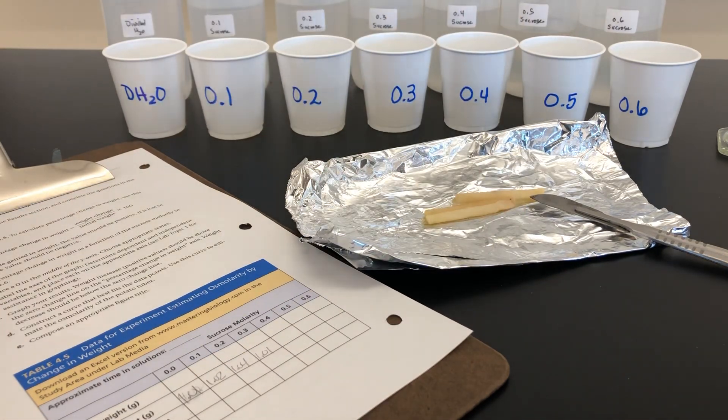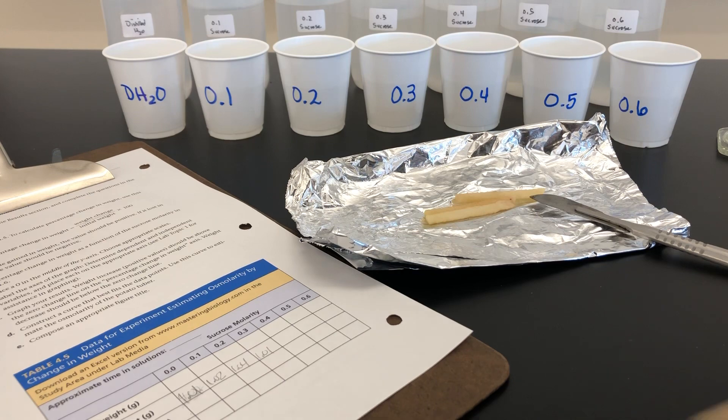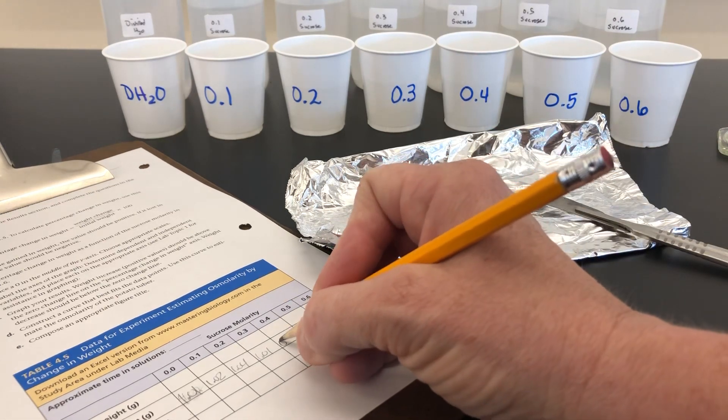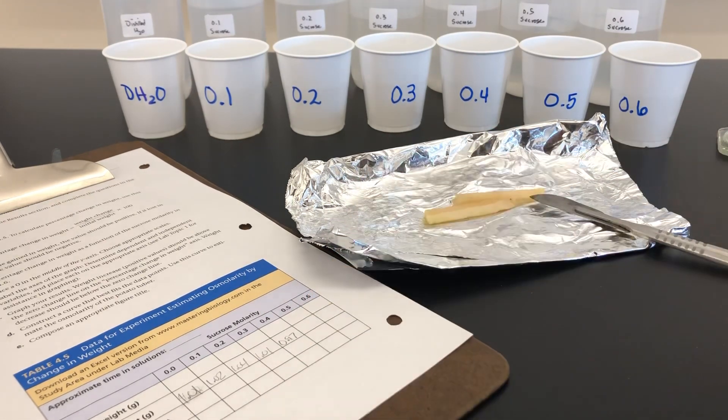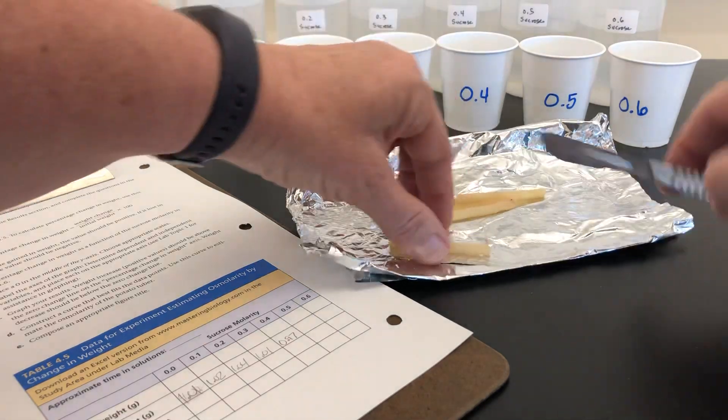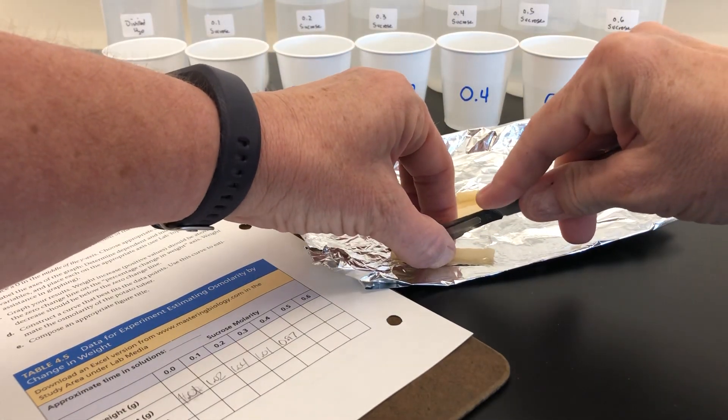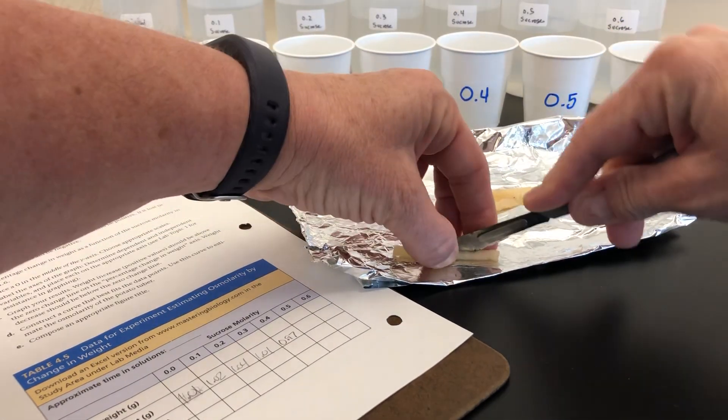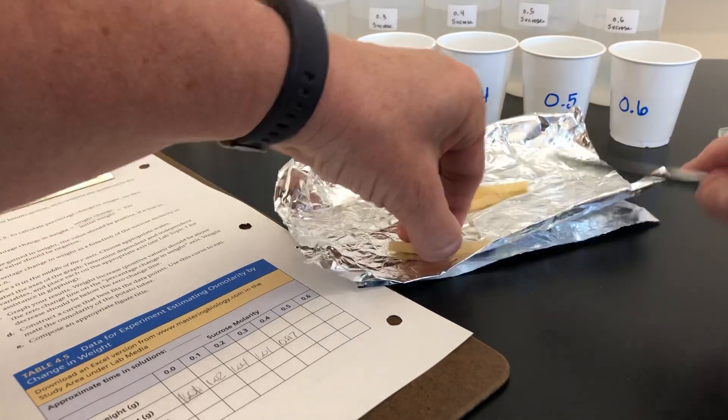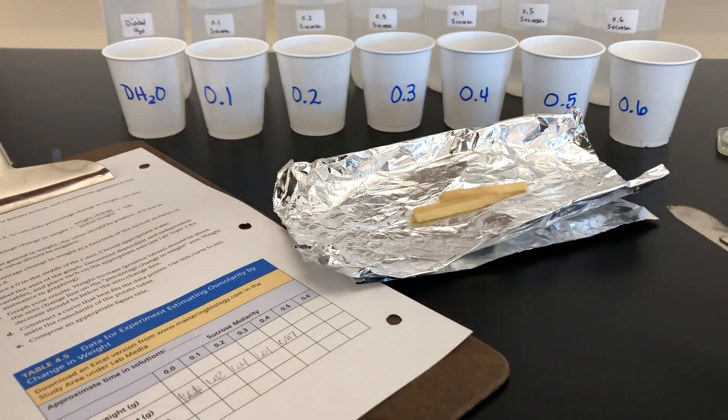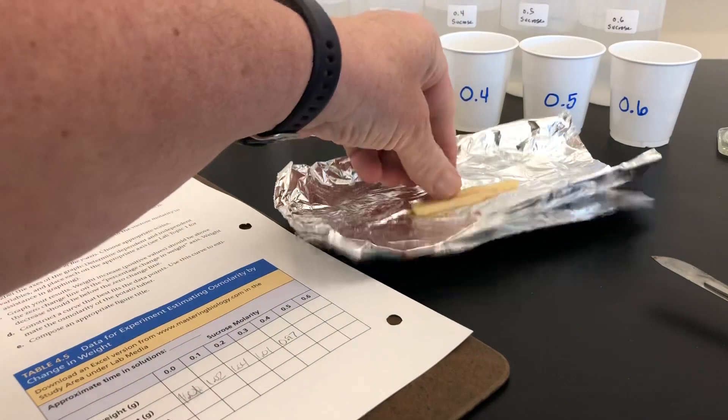The 0.4 tube will weigh 0.97. We'll place it in the last two.